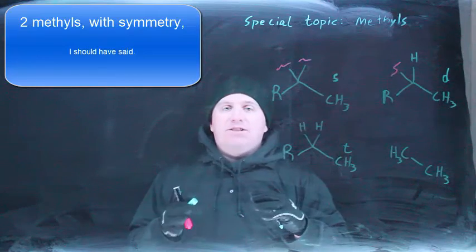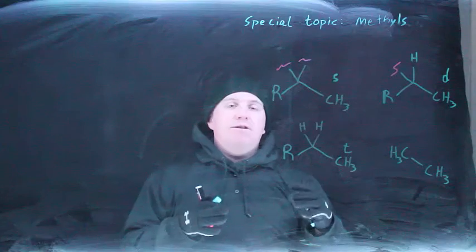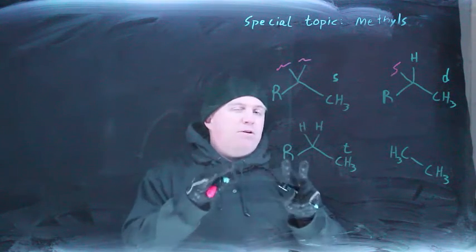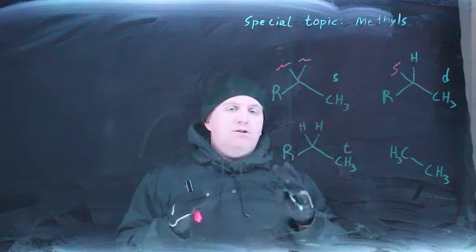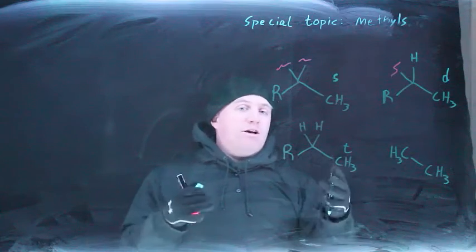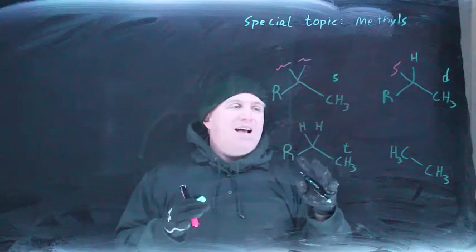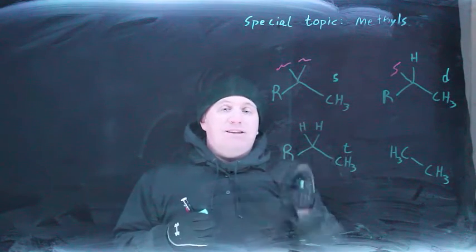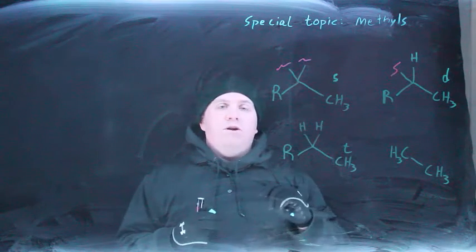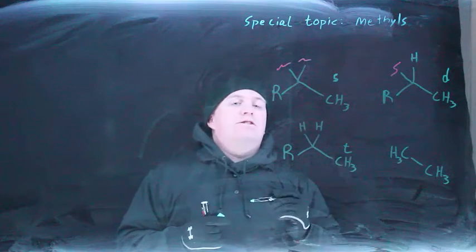If, on the other hand, you see something that's messy as heck, but integrates for 6, I'm going to have a hard time believing that that's a methyl unless it's 2 methyls that happen to be overlapping but aren't exactly the same. So again, if you're looking at a nice peak and it integrates for 3 or a multiple of 3 or is close enough that you should interpret it that way, then absolutely think methyl. But if it's something nasty looking, if the multiplicity isn't making sense, then either you have 2 overlapping peaks that you need to pull apart and resolve, or what you're looking at is not a methyl, but just coincidentally adds up to 3. And again, that strongly suggests overlap.